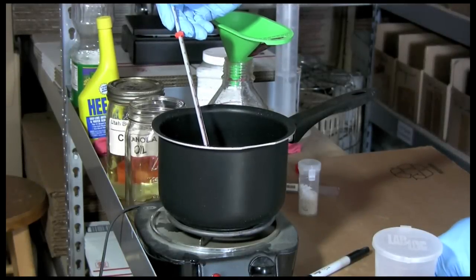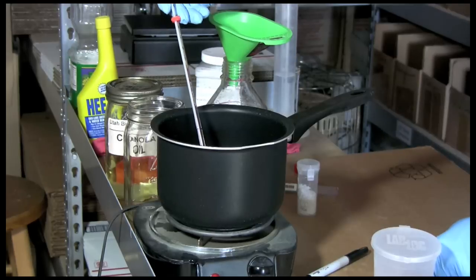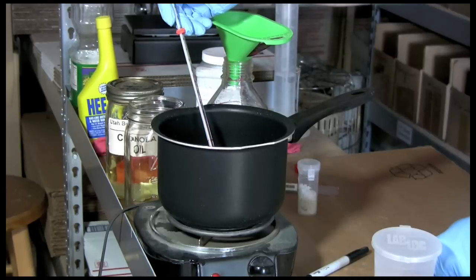As you're waiting for the catalyst to dissolve into the methanol, it's a good idea to check the temperature of your oil. We're sitting right at about 91 degrees Fahrenheit, which is getting up there. Our goal is to heat up to about 130 degrees Fahrenheit for this mini batch.